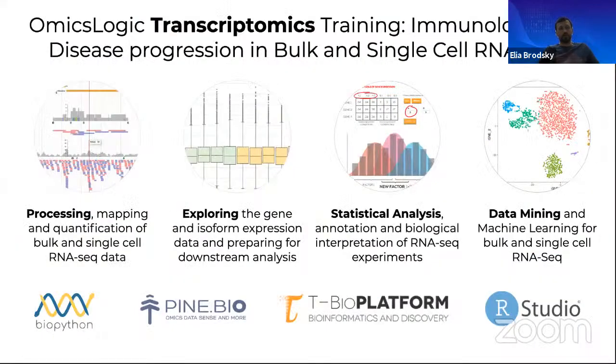Specifically, we will review methods and computational environments where such large next-generation sequencing data can be processed, analyzed, and interpreted from a biological standpoint.